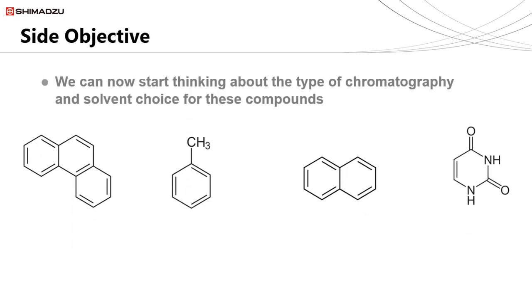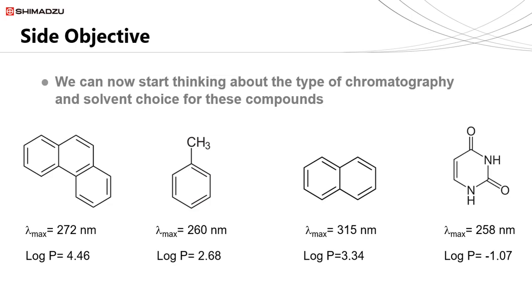We looked at the beginning of this session building our method. The physical chemical properties researched or determined experimentally. But now we need to look at what questions we need to start asking to fully build our method, and what sections we need to think about. We start with our compounds.